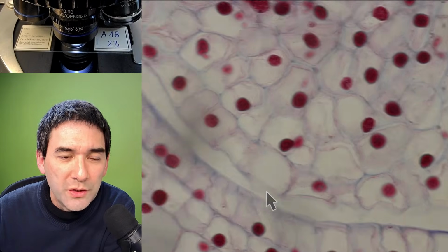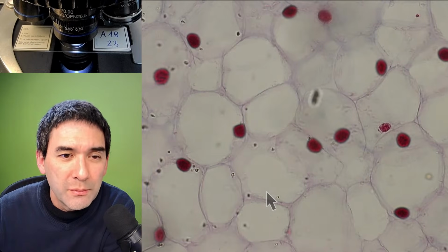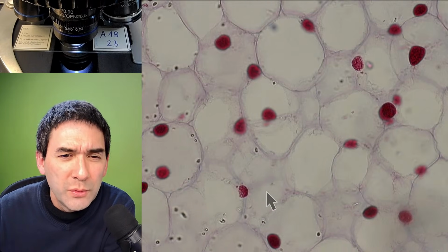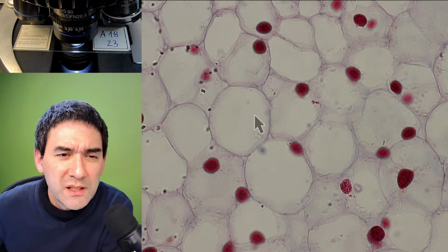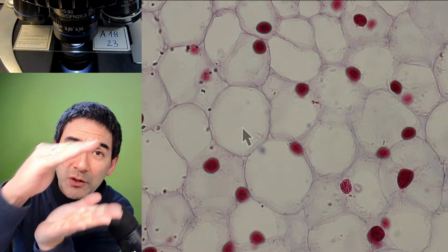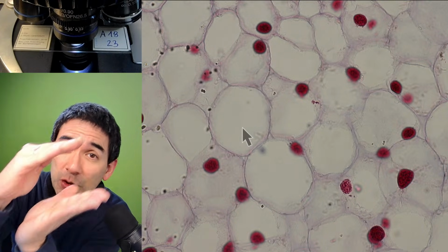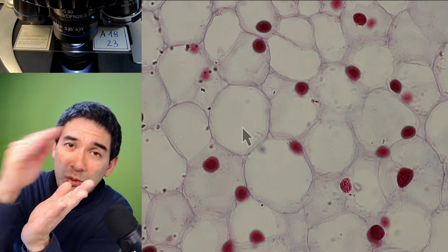In case you wonder why some of the cells do not have a nucleus, like over here, for example, you're going to say, why do I not see a nucleus over here? Some cells seem to be empty, and the reason is that of course they have a nucleus, but you don't see it because when it was cut, it was sectioned, the nucleus which was above or below was cut away.